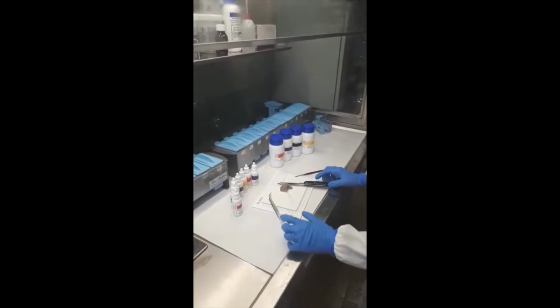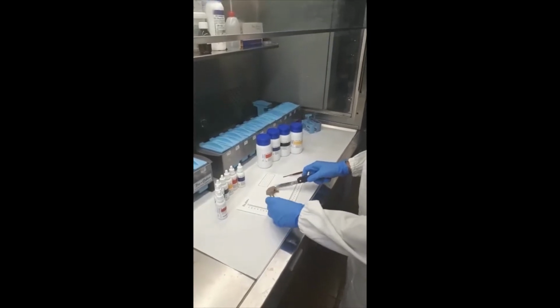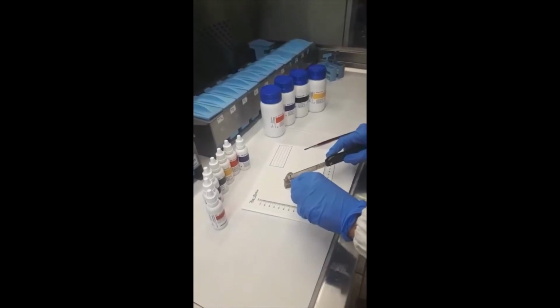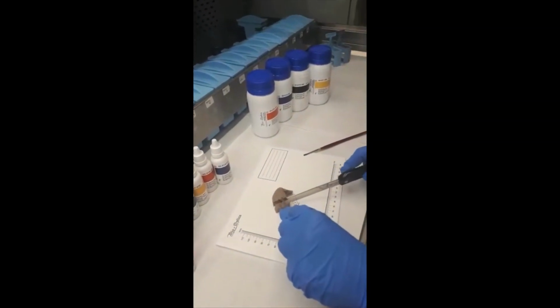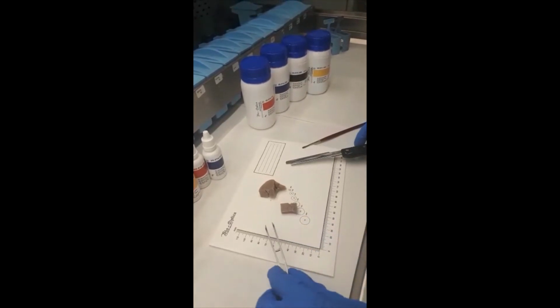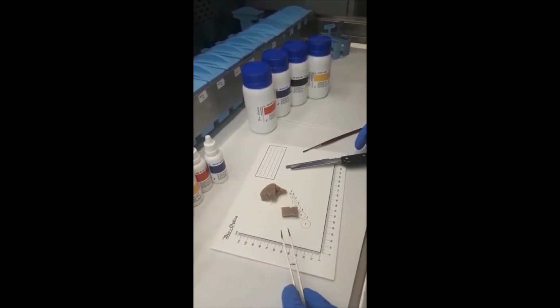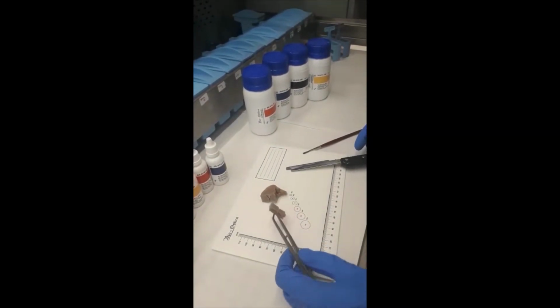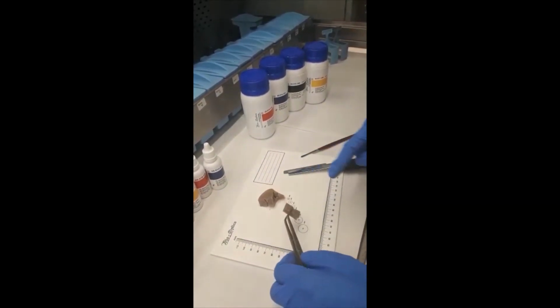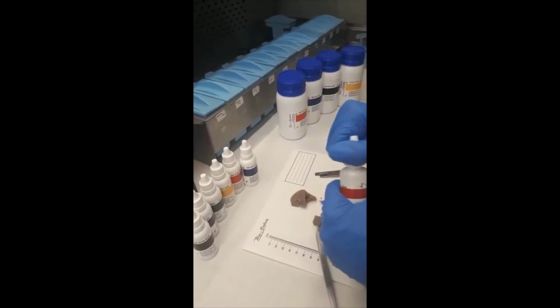So the marking dyes can be used on fresh or already fixed tissues. For example, here we have some liver. So this is already fixed. And this is the way we work. During the trimming, the pathologist identifies the margins that he wants to recognize and he chooses the colors to use. So for example, here we have two margins, one and the second one. We can use different colors, for example the red.